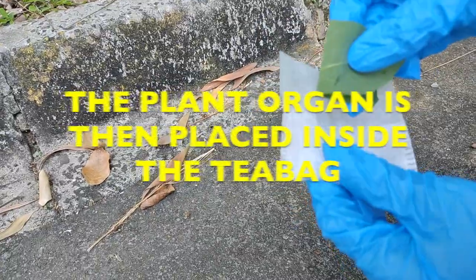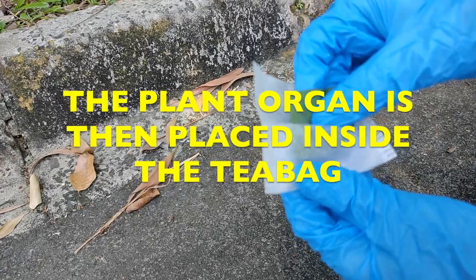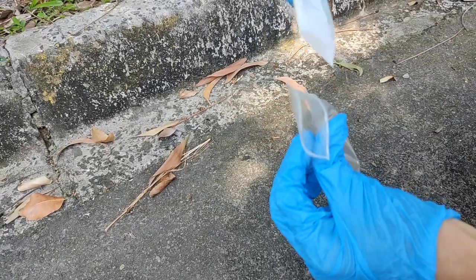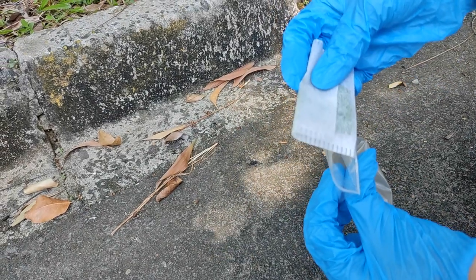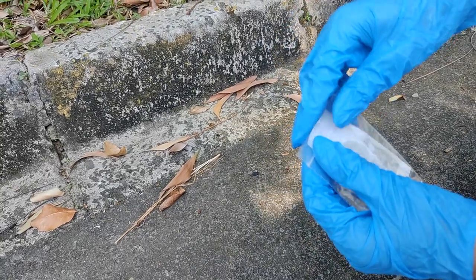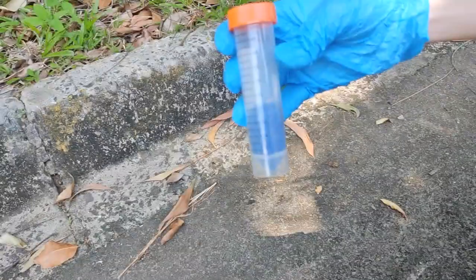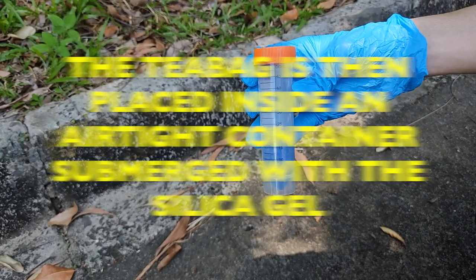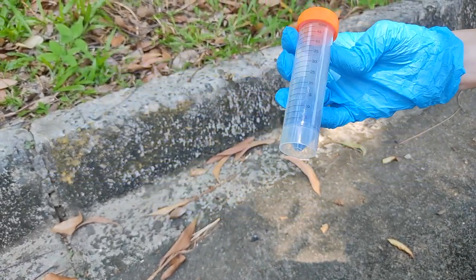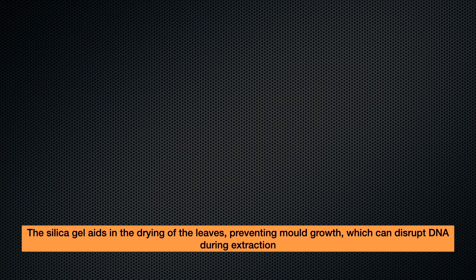Cut the youngest leaf you possibly can using the sterile scissors. The plant organ is placed inside the teabag, then put the teabag containing the plant organ inside the ziplock bag. The teabag is then placed in an airtight container and submerged in silica gel. Silica gel aids in the drying of the leaf, preventing mold growth which can disrupt DNA during extraction.